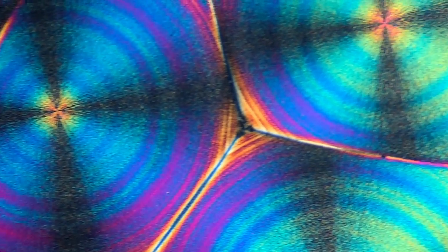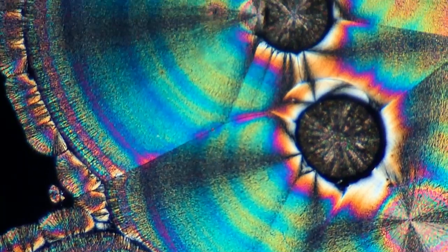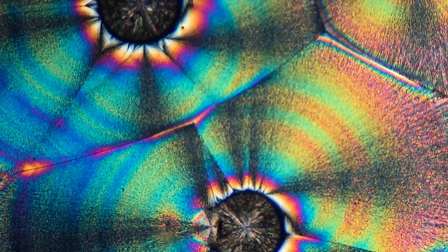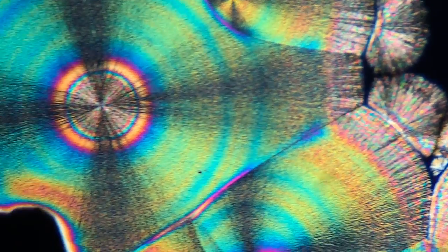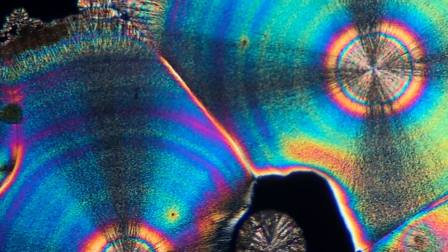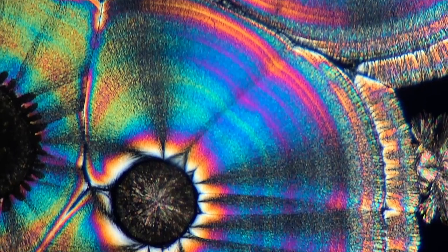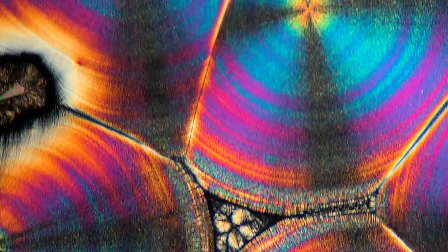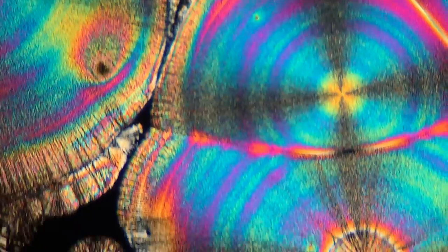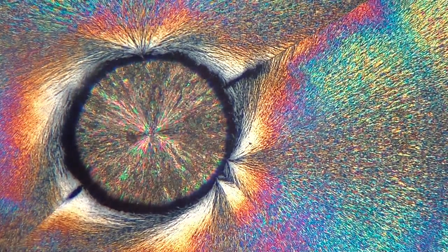This is kind of what vitamin C crystals typically look like under the microscope. This color and pattern is what you'll often see, and this is with the lowest magnification — so you could probably see these with your naked eye, but it's just hard to see through the polarized filter paper. I'm shining a really bright light through this right now. These are really, really cool, super psychedelic. This one kind of looks like a peacock feather to me.